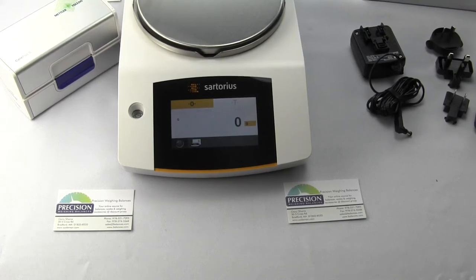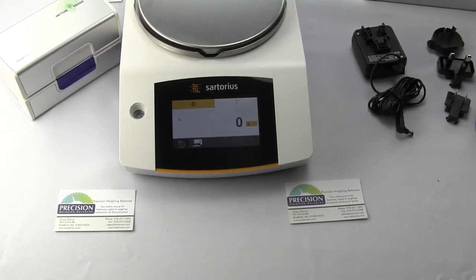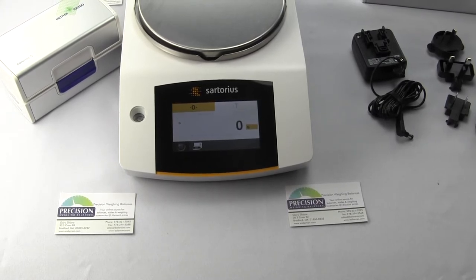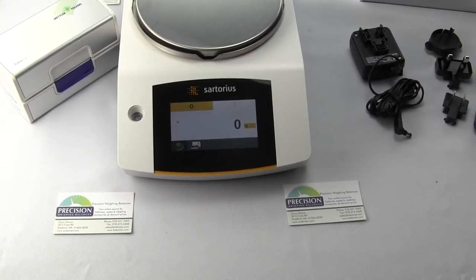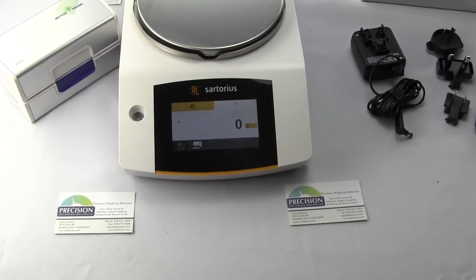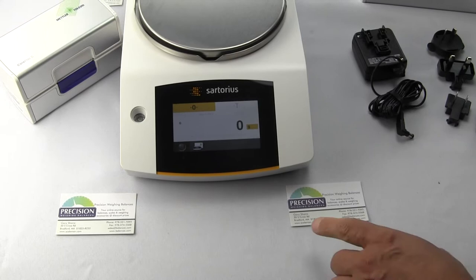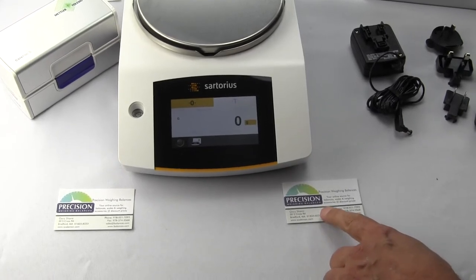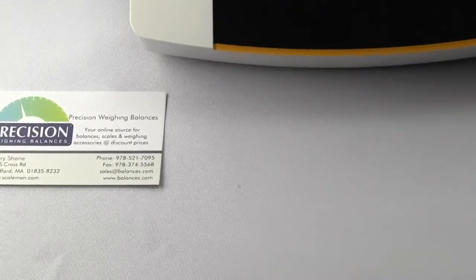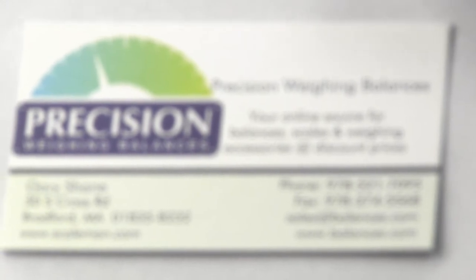In this video we're reviewing the Practum 5100-1 lab scale and showing you some of the features that come with the Practum model. We are Precision Weighing Balances, an authorized Sartorius distributor, and you can purchase the full line of Sartorius laboratory balances at either balances.com or scaleman.com.